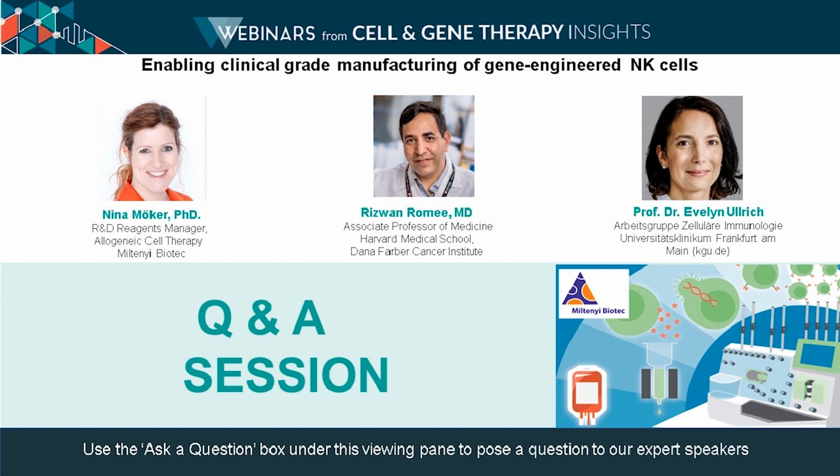Concerning engineering of natural killer cells, I think we have improved technologies a lot in the last years, so that we can now engineer primary NK cells from different sources as well as iPSCs. And I think Nina has already presented the possibilities of both: viral transduction and also non-viral procedures for efficient, stable transduction of NK cells. That helps a lot.